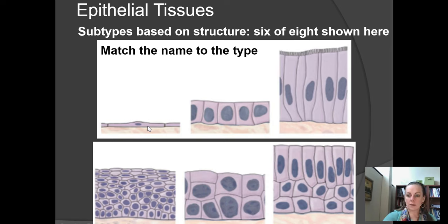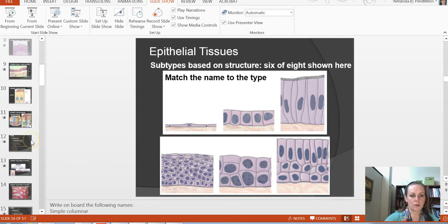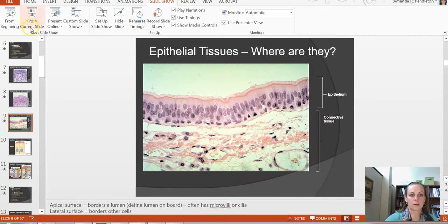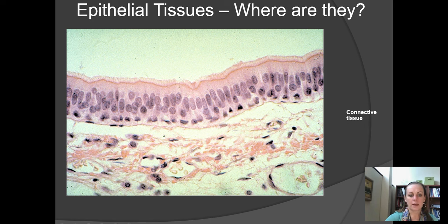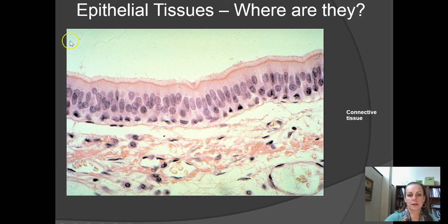Now, one thing that you may notice is each of these cells, they're going to have a circle inside of them, and that is a nucleus. Okay, and let me actually show you this on a real tissue sample. This is a good one. Okay, again, here we've got our white space up at the top. First tissue we're going into is going to be epithelial tissue.